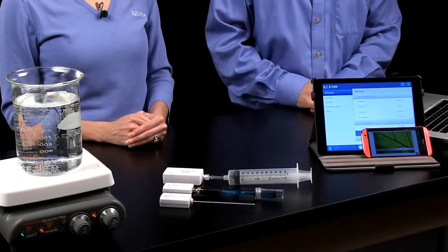And we're here today to introduce some wonderful new wireless sensors. So we have wireless temperature, wireless pH, and wireless pressure. And this is the beginning of a wireless family that we think is going to really unleash the imagination of your students in your classes.